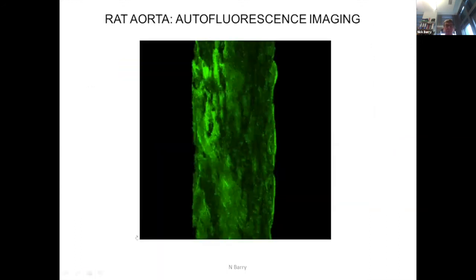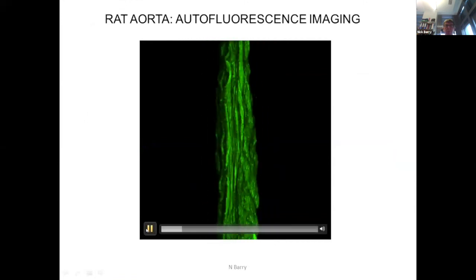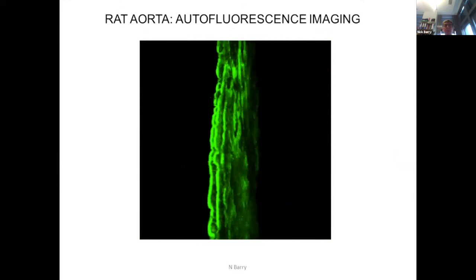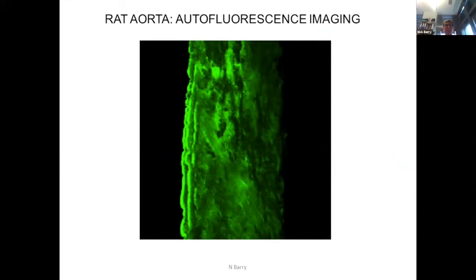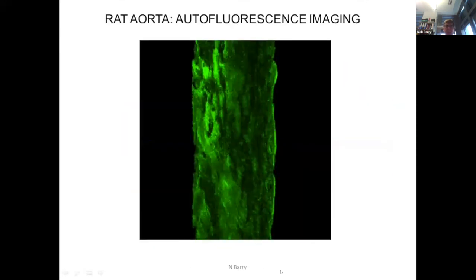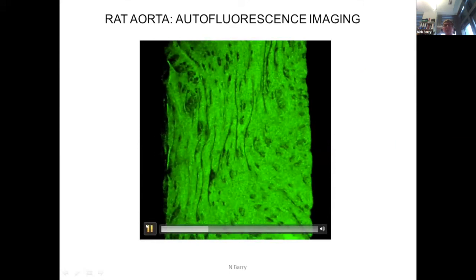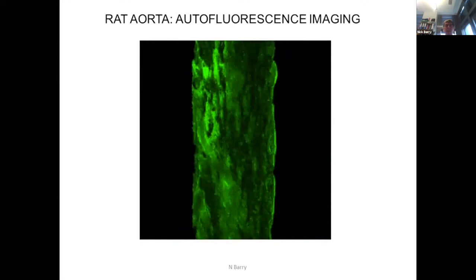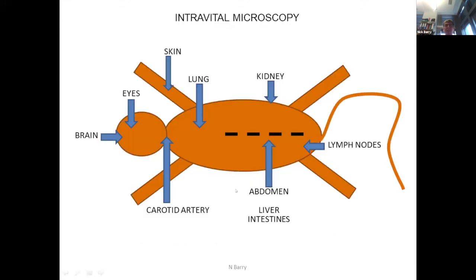It comes from this movie. I mean, it often used to bother me, how is it that white blood cells can get through the wall of an artery and get into the middle of the artery? And you can see that once you look at this as a three-dimensional structure, the answer is there in front of you, but it's certainly not apparent from the single slices.